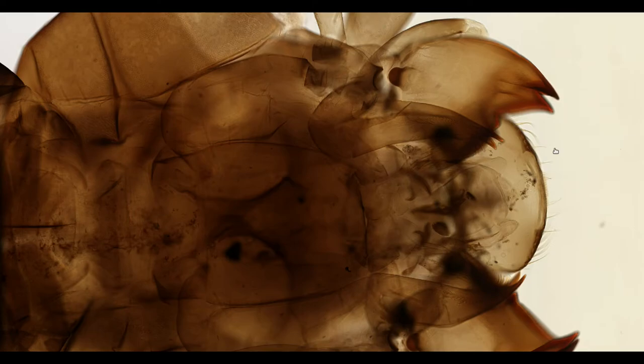What's really visible on this slide is a fraction of the apparatus that an earwig possesses for chewing up food, so we'll go through what's visible and then I'll give you some sources if you want to really look at an earwig's face.